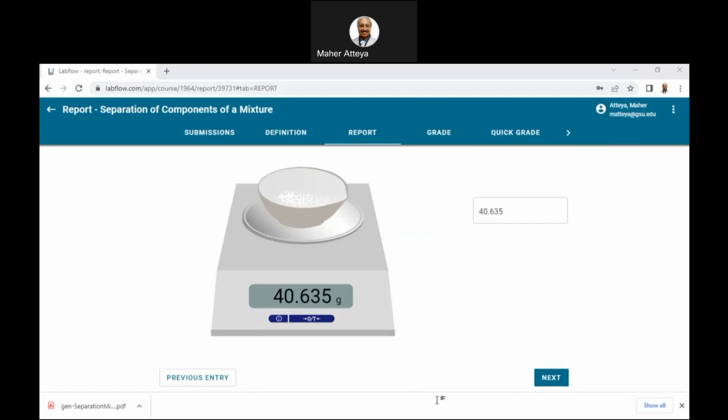Okay, and paste. So now, remember this is crucible 1. I think we need to enter the crucible number 2 as well, we'll see. Now let's see here. Say next. So we did have this one here, the 40.635. Save it, just make sure it's saved. Go back and look at next.